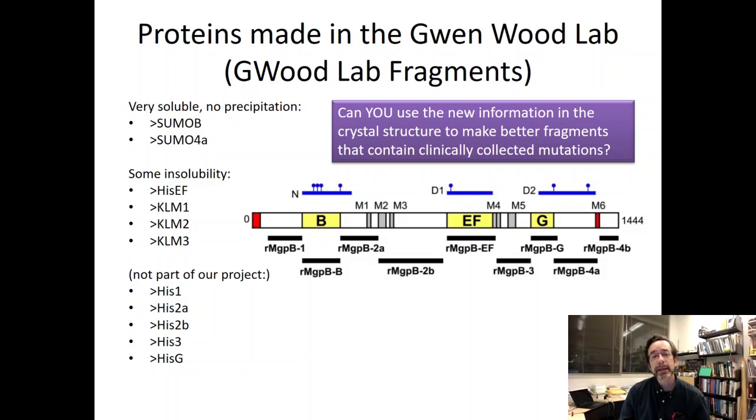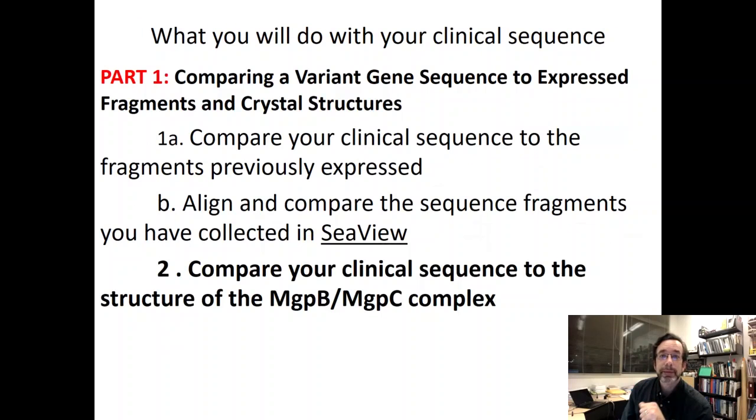And so HIS-EF and KLM, they tried to make 3 different KLM fragments, and none of those were very soluble. So let's see if we can improve that. So what you're going to do, these are the steps that you're going to do.